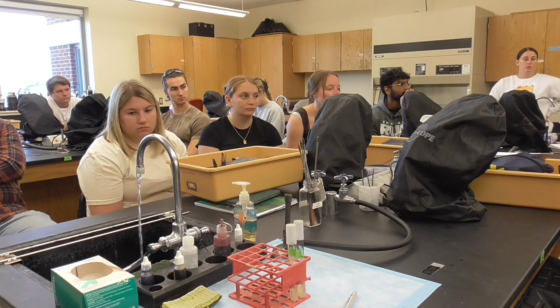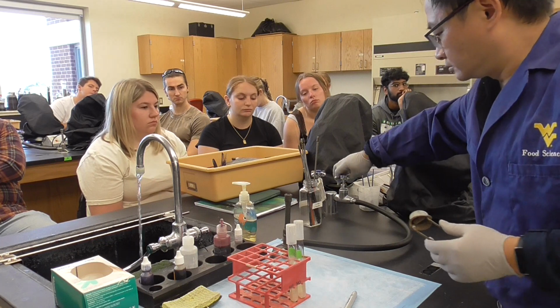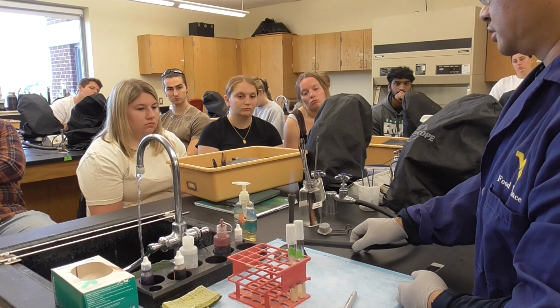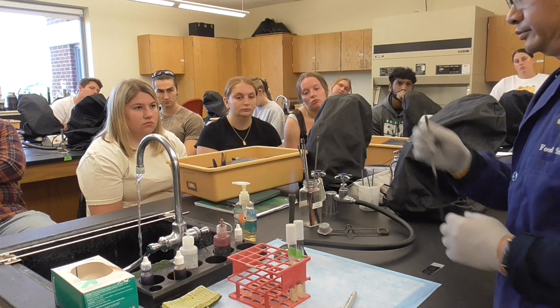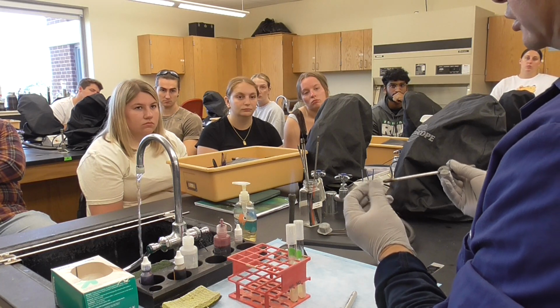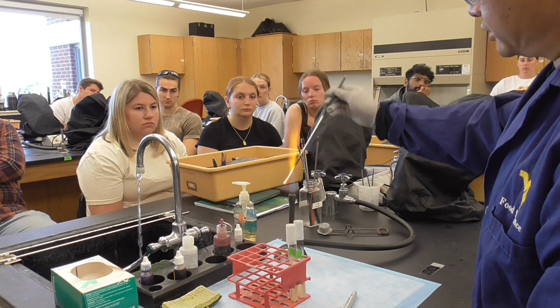That may be working. So it works. It's good. That's a good amount. Okay, now we have a loop. What's important for that? Make sure it's straight. And we're going to flame it first, because more or less I have some bacteria there.